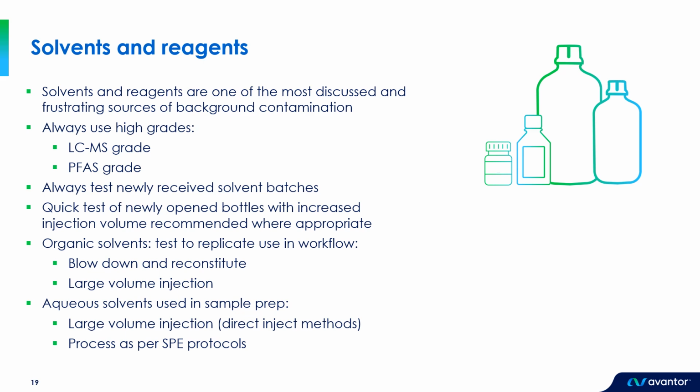So the general recommendation is to always use the highest grade solvents and reagents possible, such as LCMS grade. Recently, some manufacturers have also introduced PFAS grade solvents, which are typically batch tested to conform with PFAS testing methodologies. It's essential to always test newly received solvent batches before using them. So personally, I do a quick test of any newly opened bottles with an increased injection volume, like we discussed earlier, to ensure that the new bottle is clean.